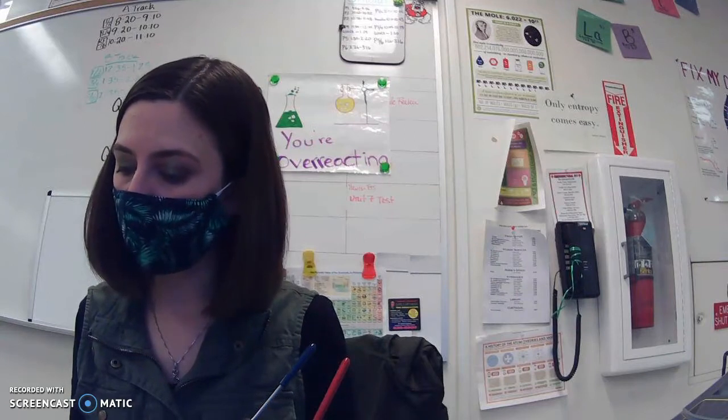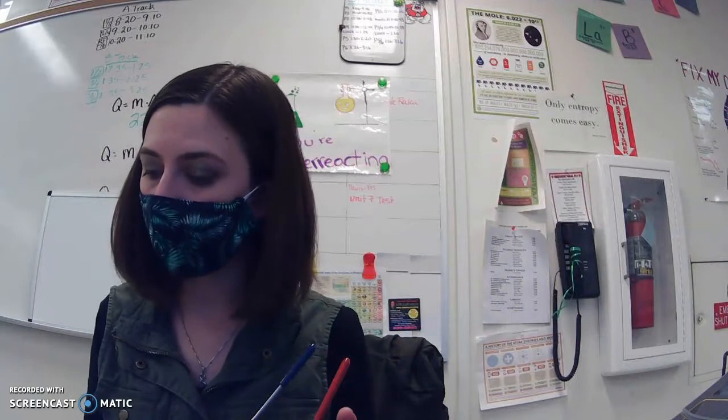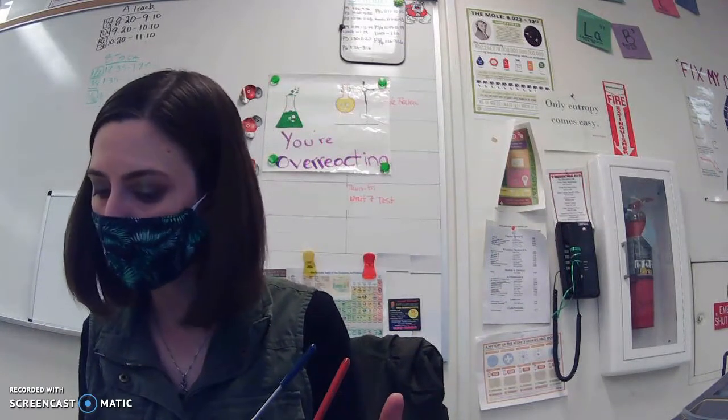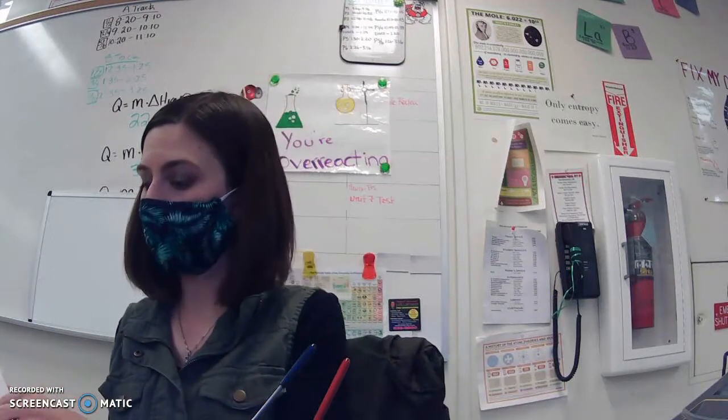And then we're going to watch a video and explain flocculation. In future labs, you'll use the river water samples that have been flocculated. What will have been removed from those samples? What does flocculation mean? What does it never remove? Answer those questions after you watch the video.